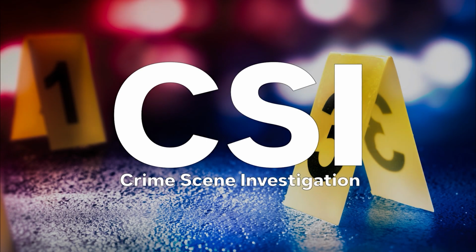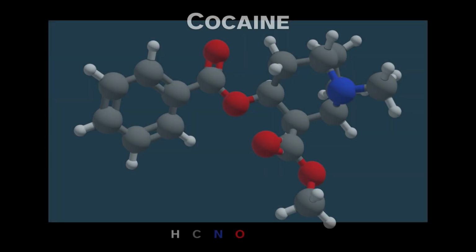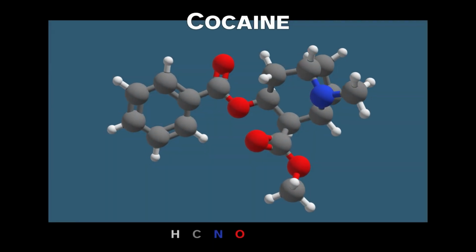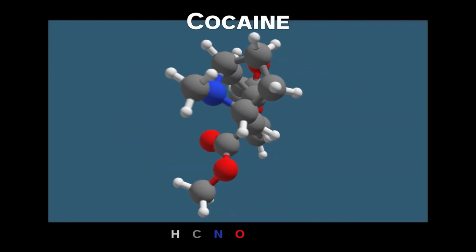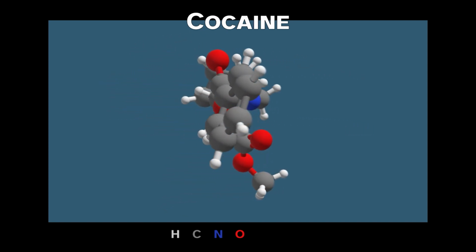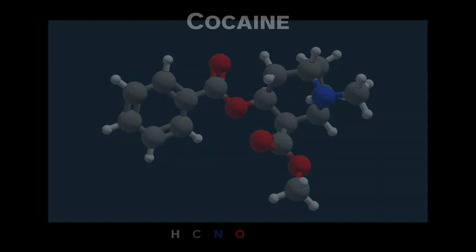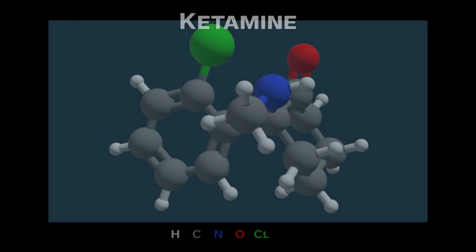CSI, Crime Scene Investigations. The CSI dramas were a very popular franchise of television shows. CSI Las Vegas ran for 15 seasons, CSI Miami ran for 10 seasons, and CSI New York ran for 9 seasons. At their core, these shows highlighted the role that laboratory analysis played in the crime-solving process, as far as television crime dramas are concerned. Virtually all of the street drugs can be detected, identified, and quantified by high-performance liquid chromatography.